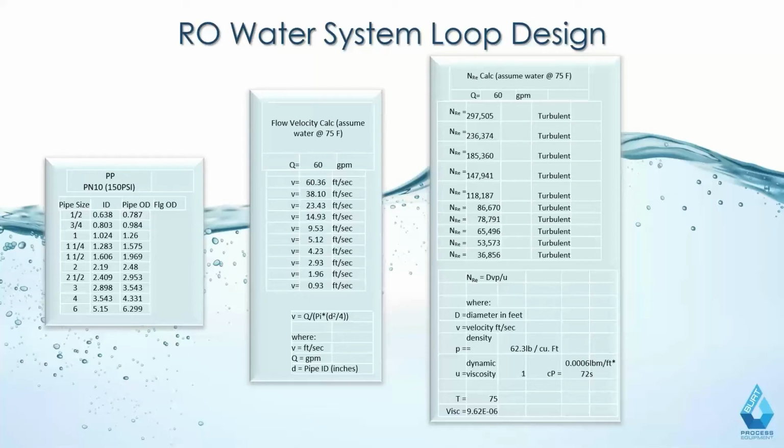Sure. And so one of the things is when you're talking about a high purity water system and you have the UV lights, that's sanitizing the water. That's not inherently sanitizing your loop. Any water system that you're passing water through, and as I mentioned before, turbulence is a concern, but you have weld spots, you have turns, you have valves, whether these are ball valves, which are obviously less clean than, say, a diaphragm valve for trapping water. You do end up with bacteria buildup in your loop, which, obviously being high purity water, is one of the major concerns in different water qualities: how much CFU per mL or 100 mL or 1,000 mL of bacteria is present. And sanitizing a loop, the frequency depends really on what your water quality is.